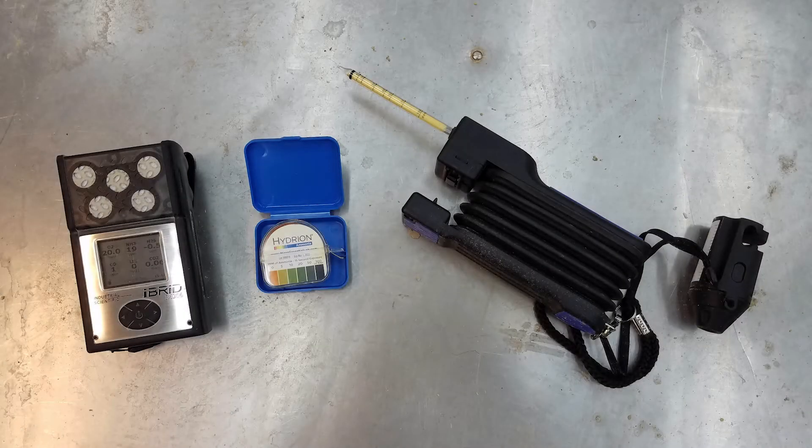In this video we are going to make comparisons of ammonia gas measurements from three different instruments: a portable personal gas monitor, paper test strips, and colorimetric pull tubes. These instruments can be used to take quick spot measurements to check the ammonia gas concentration in animal barns.